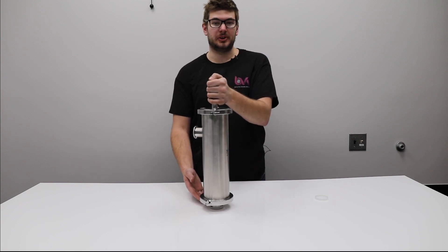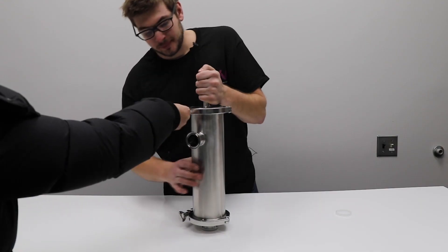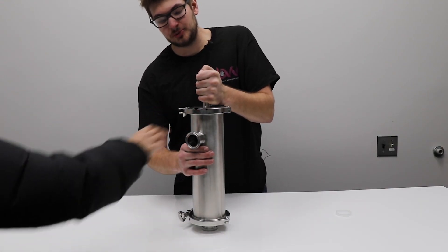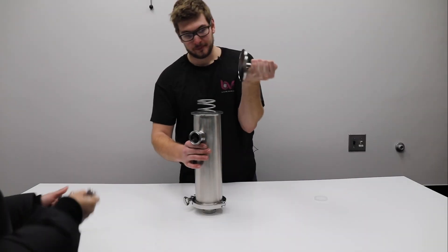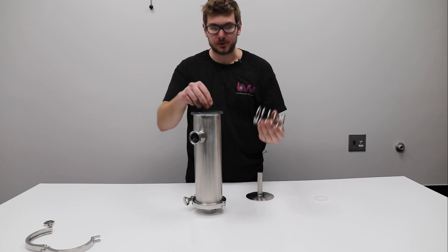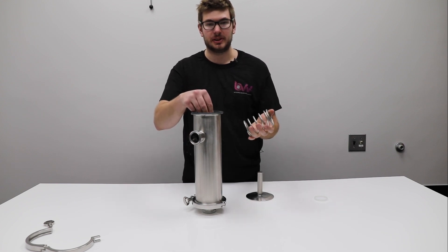It'll take out large particulate. So let's look inside. You start by just taking off the top clamp. This is a two-person job — it is spring-loaded. So after removing the top, you can see the spring inside that holds everything together without having too many gaskets.